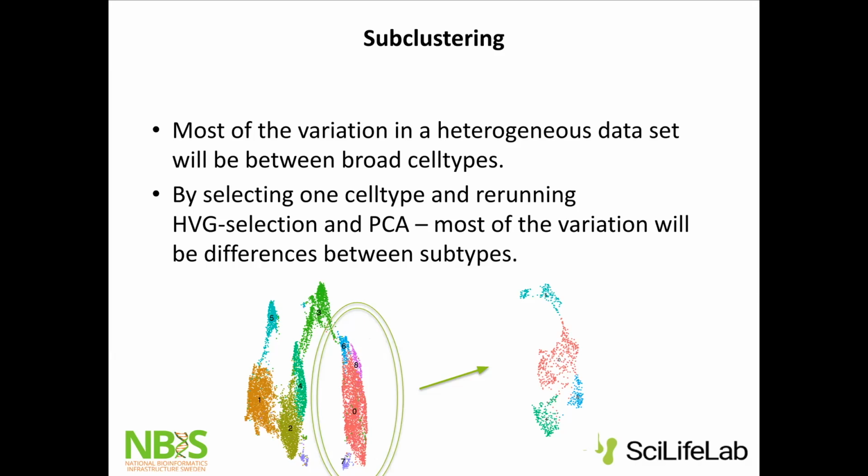Yeah, I don't know if I understand how you get the genes in cluster 0 if I want to evaluate the biology of that. Yeah, then I would do differential expression of cluster 0 versus 8, 0 versus 6, and then possibly 0 versus all the rest, to try to figure out what is the signal in 0, and does it make sense that this is its own cluster?